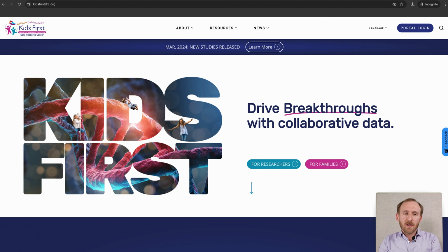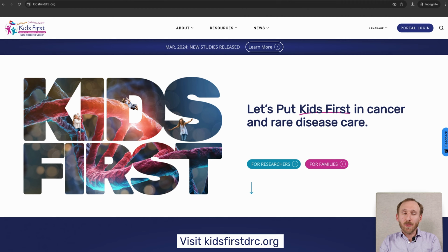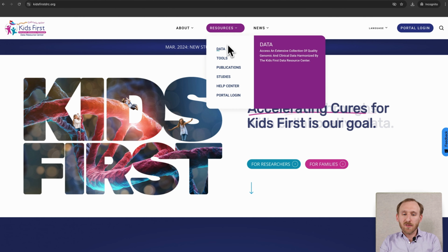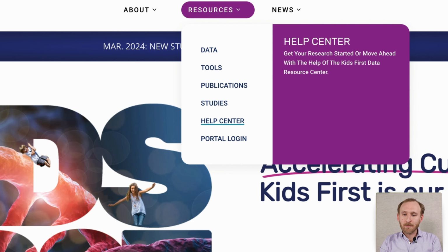Open your preferred web browser and navigate to kidsfirstdrc.org. Here you'll find information about diverse data sets available through the Kids First portal, an overview of the resources and tools available through the Kids First Data Resource Center. You can browse through available Kids First studies, as well as news stories and recent publications, and much more. Within the Resources menu, you'll find the Kids First DRC Help Center, which is home to guides, tutorials, and other information to help you use the Kids First portal.